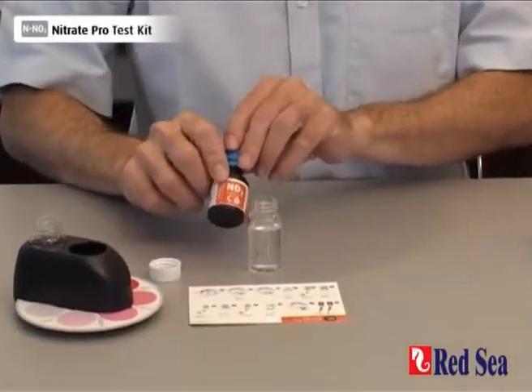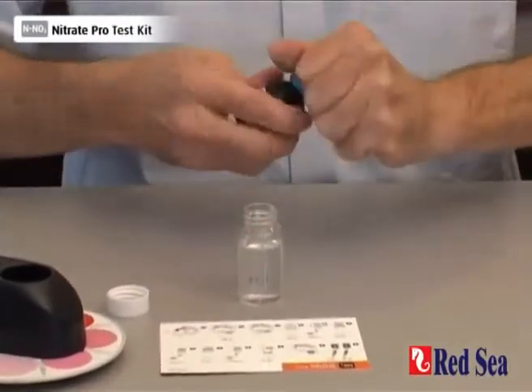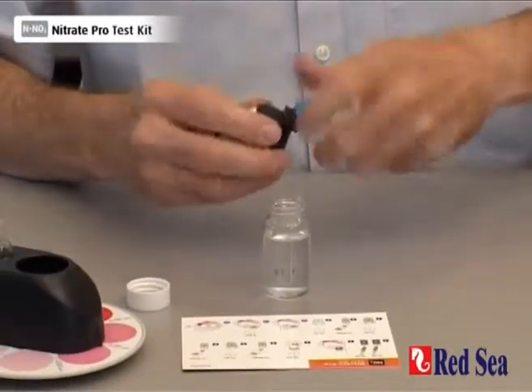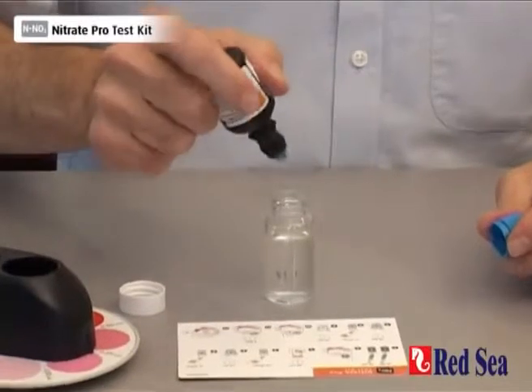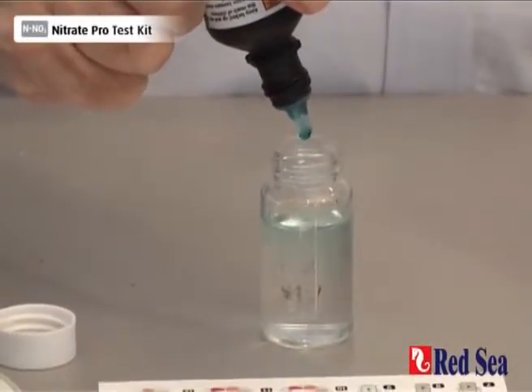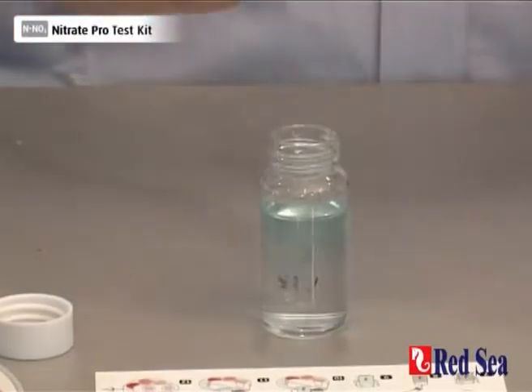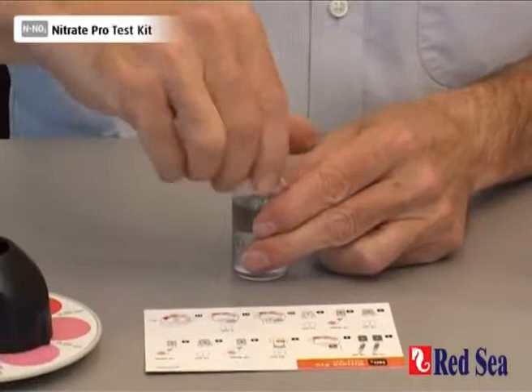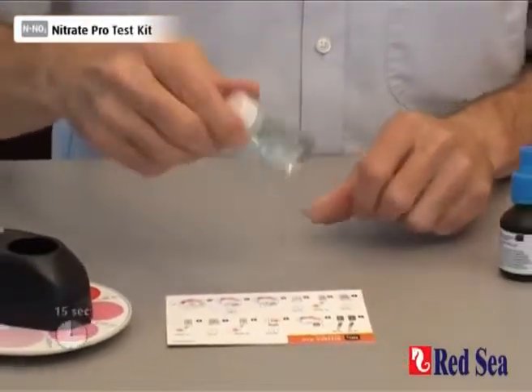Lastly, we add another five drops of Reagent C: one, two, three. And again, we shake for 15 seconds.